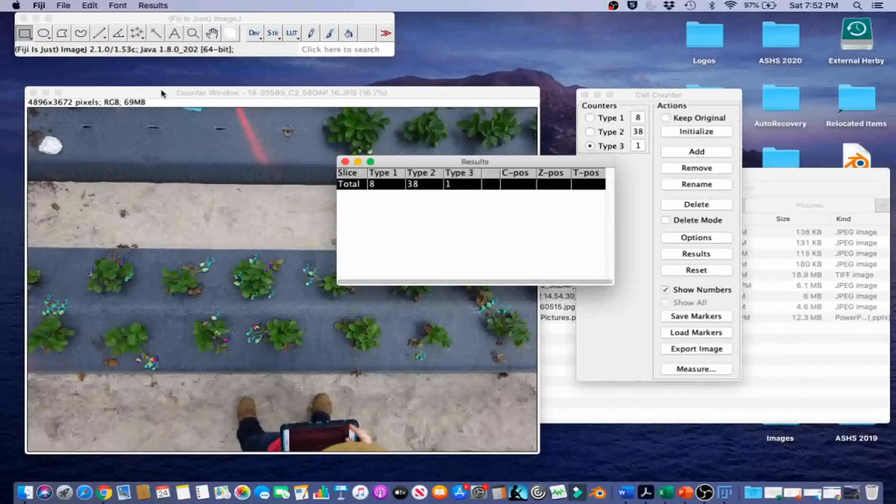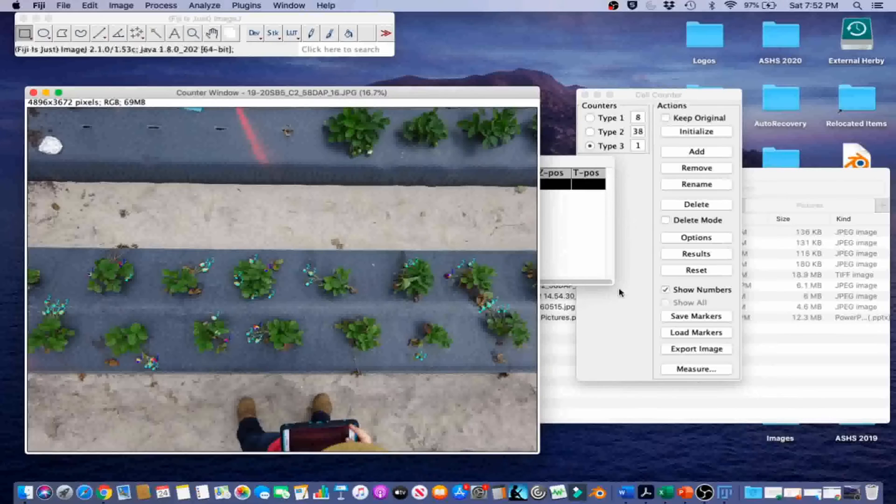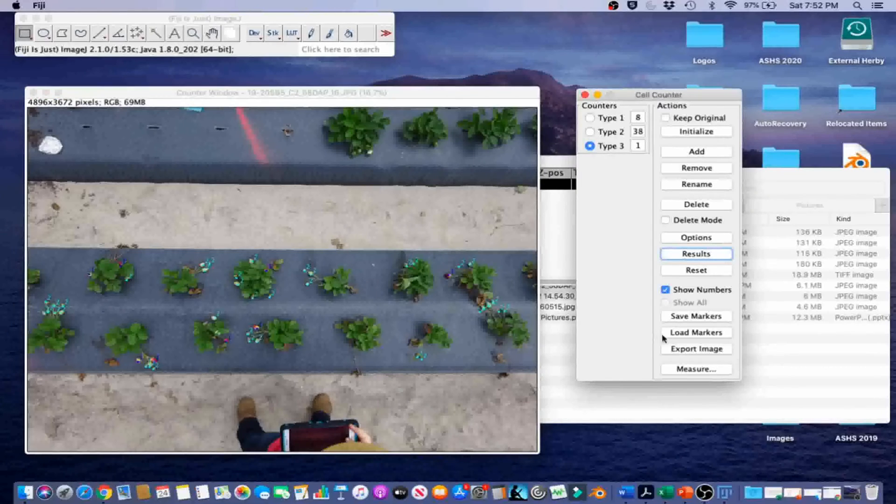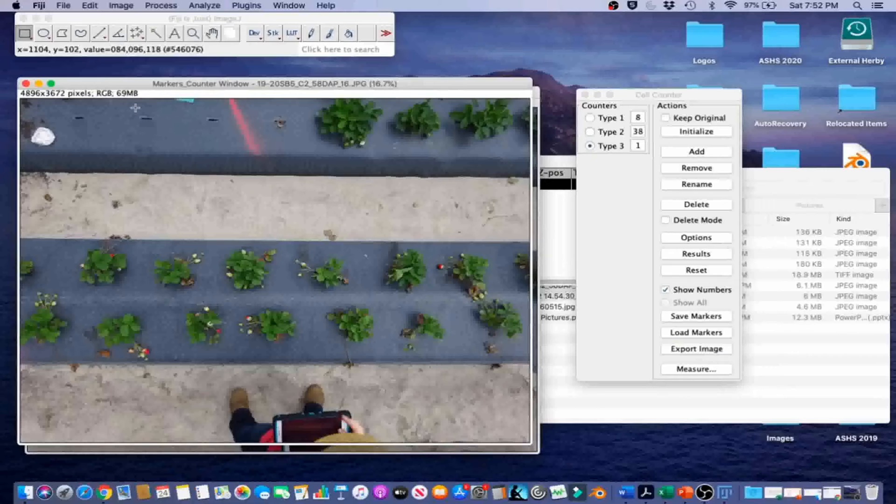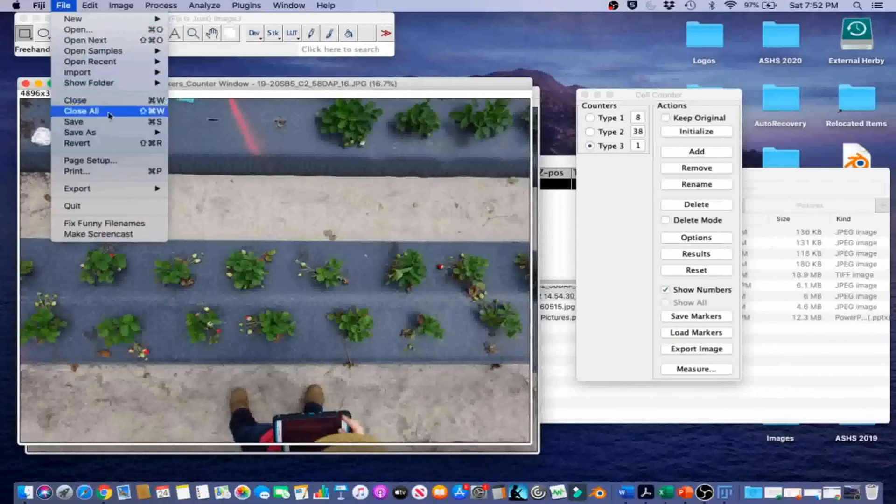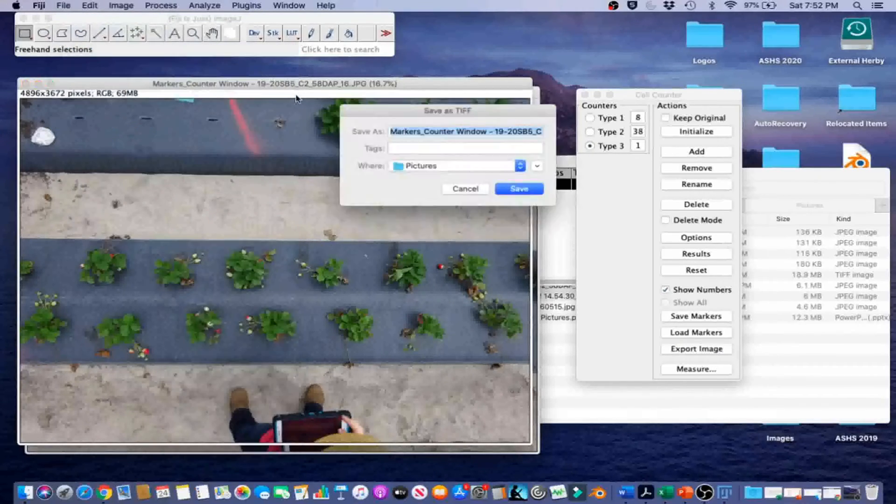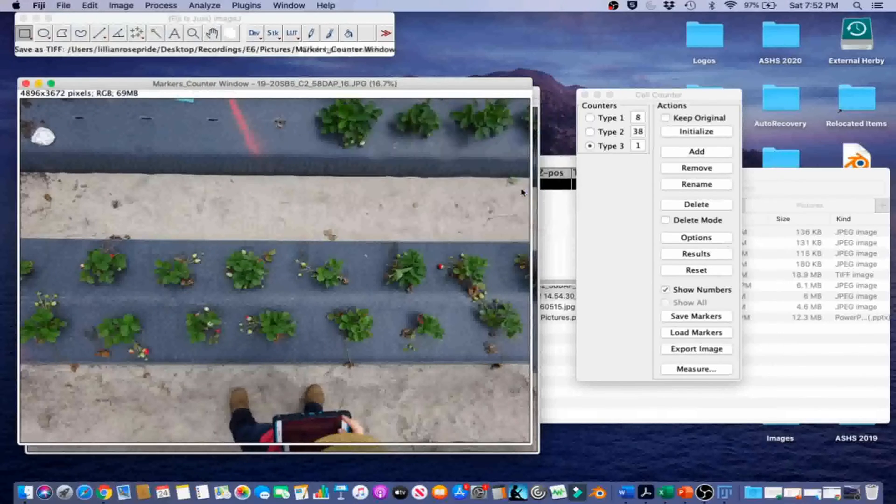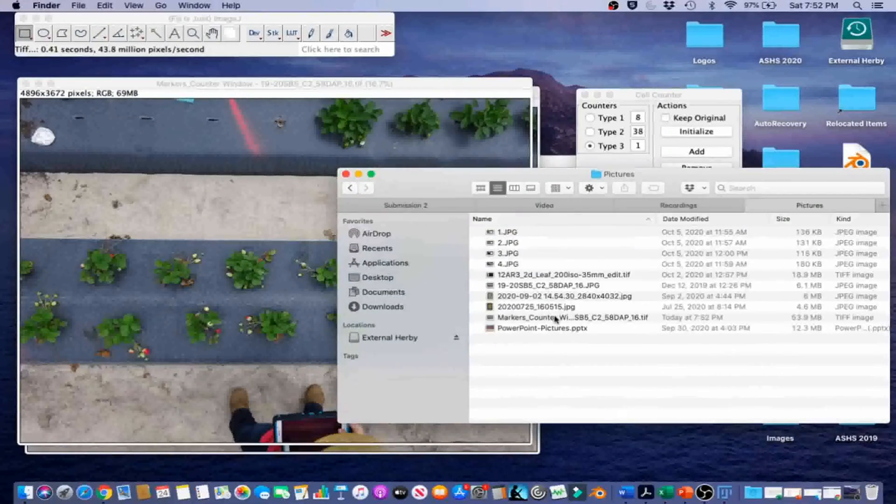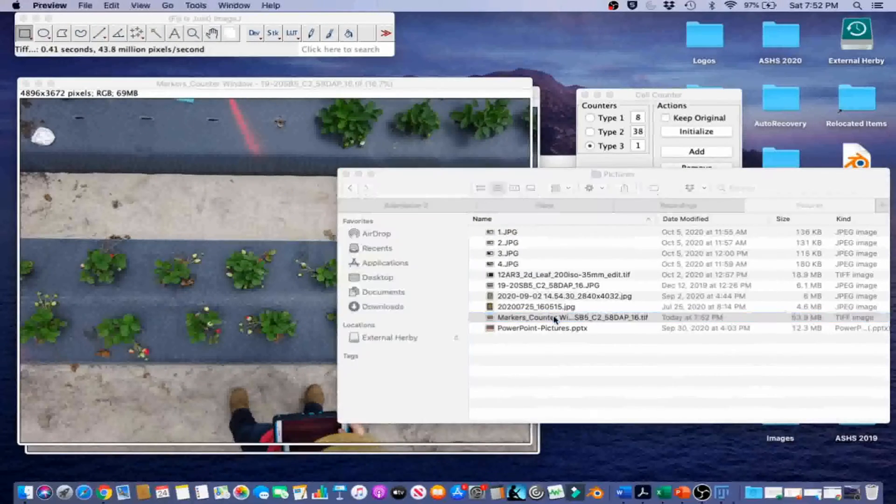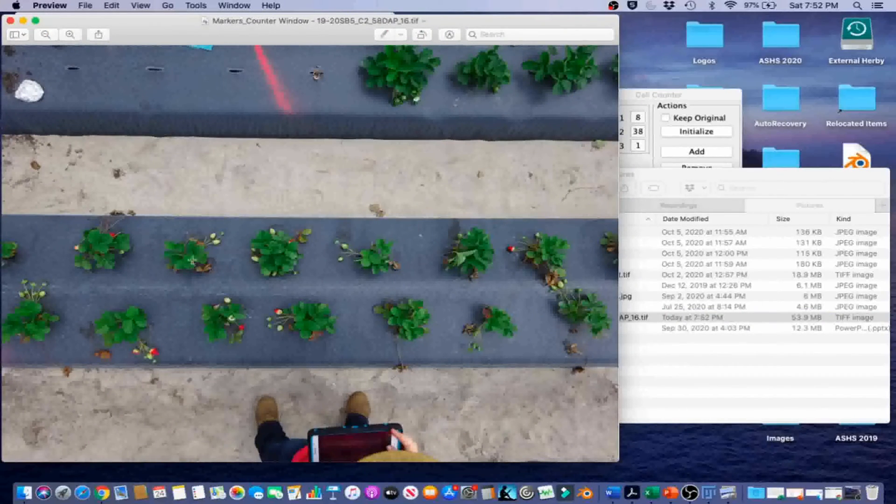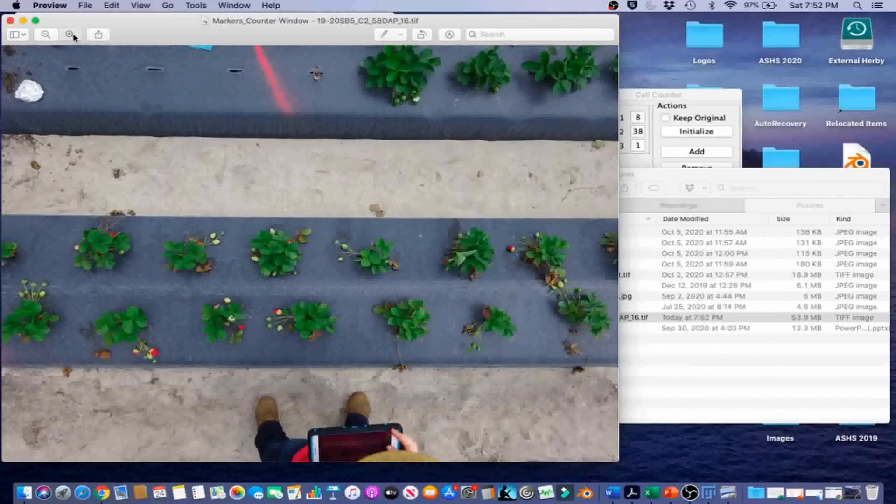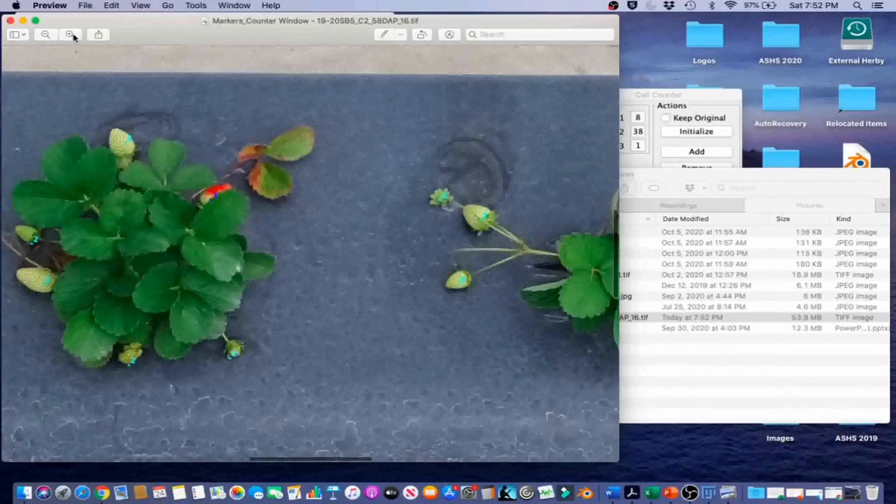If we wanted to export the image with the numbers on it, we can go ahead and click Export Image, and then File, Save As, maybe TIFF, whatever it is that we want. And then, that does save a version of the image with the numbers. They're pretty small, so you have to kind of zoom in to see them, but they are there.